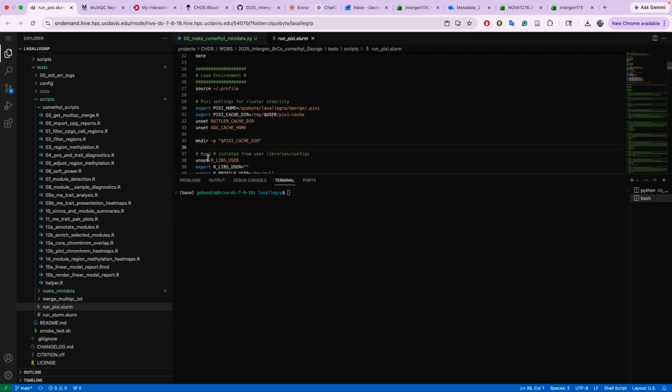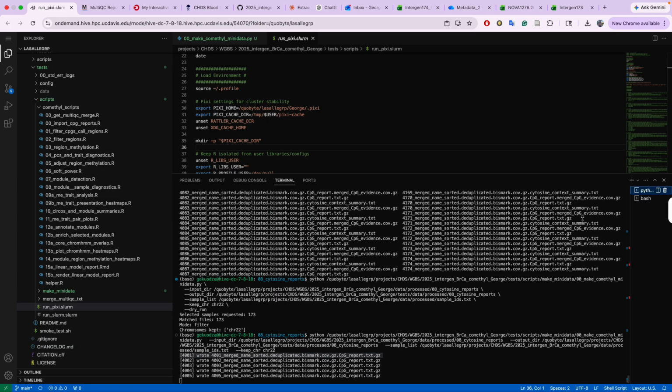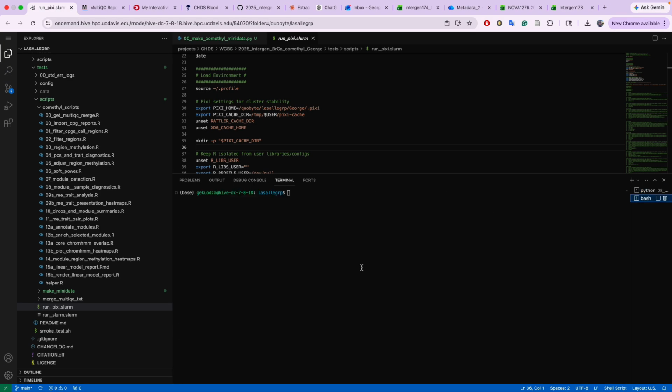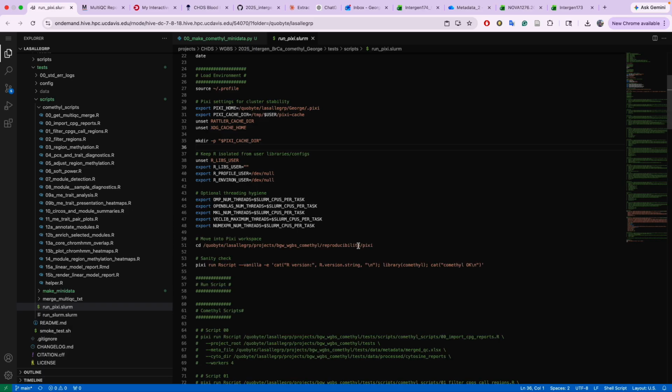So this is all right. So let me see. Okay, so it's done 6 files. All right, so this might take some time.